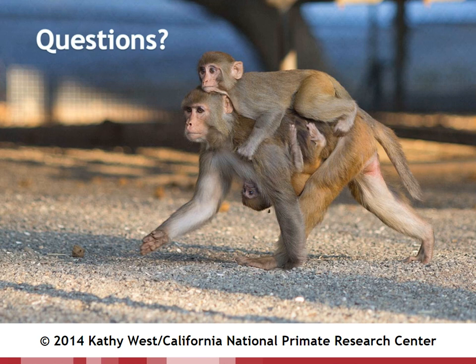Excellent. And I think in the interest of time, we'll just have one last question here. Marilise has asked, how long do you believe that the changes in the delta and beta waves for the benzodiazepine induction remain altered? If you're thinking about how long after the injection, so we actually did the administration, and then we looked at 30-minute intervals for 2 hours. And during the first 30-minute intervals, so the first hour, you still see those increases in beta and increases in delta. But already in the second hour after the treatment, those effects start to dissipate. So in terms of acute effects, it's actually pretty rapid.